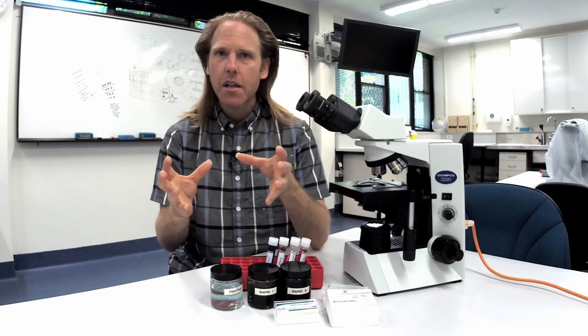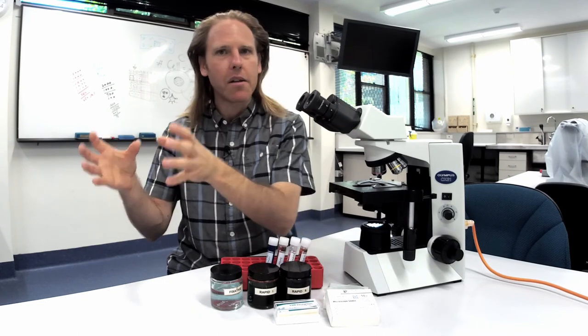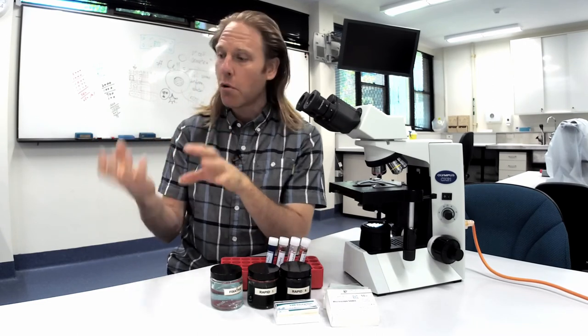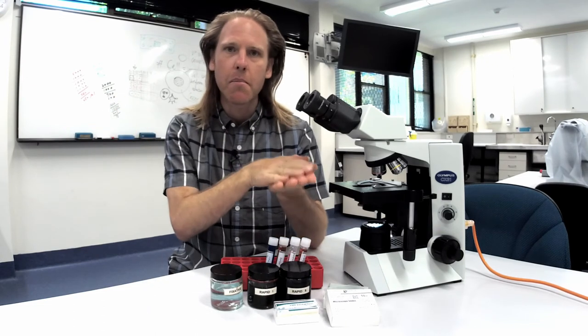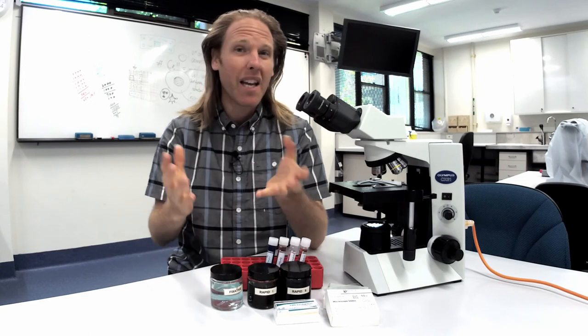When you're packaging your samples package samples for cytology separate to any samples for histology. The formalin fumes will leak out during transport and can fix the material on the slides making it non-diagnostic.